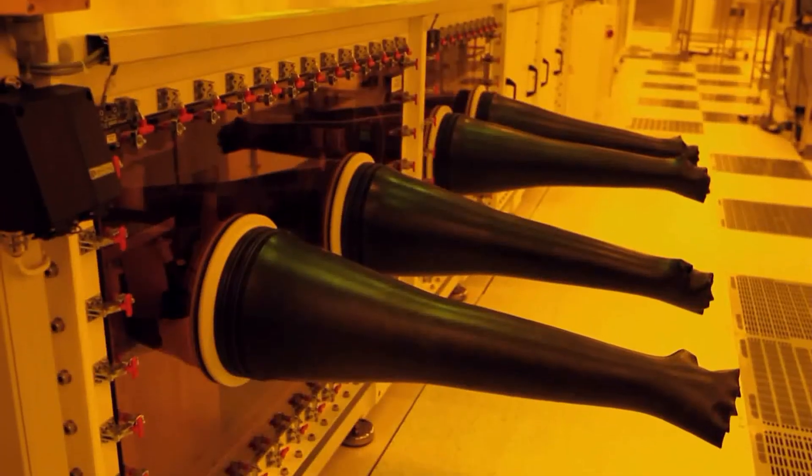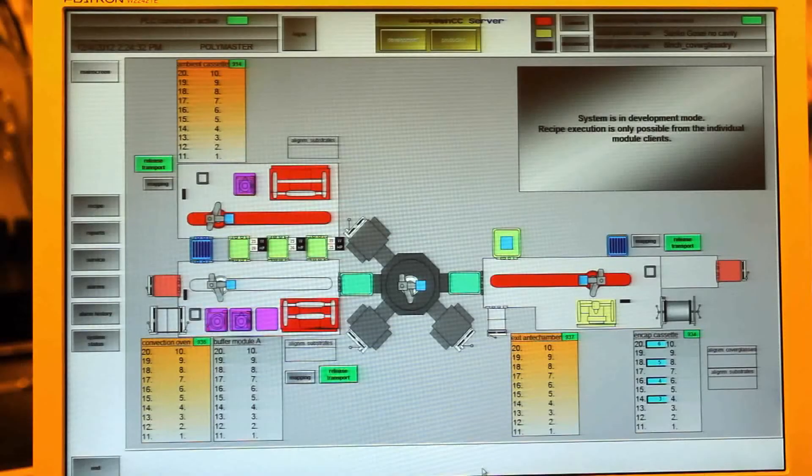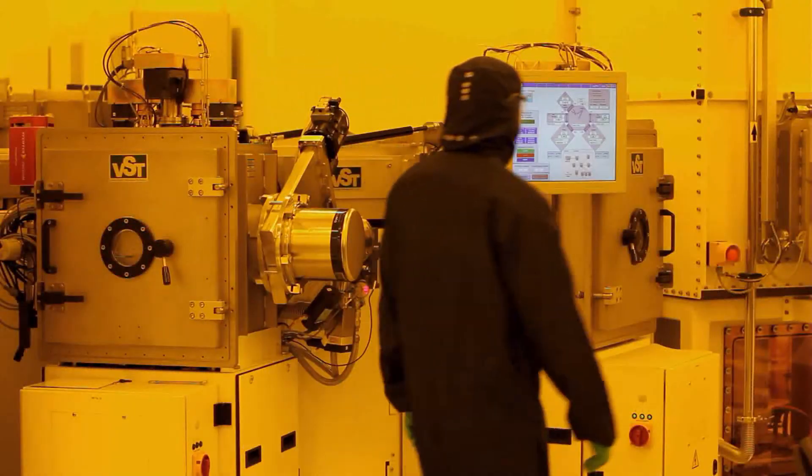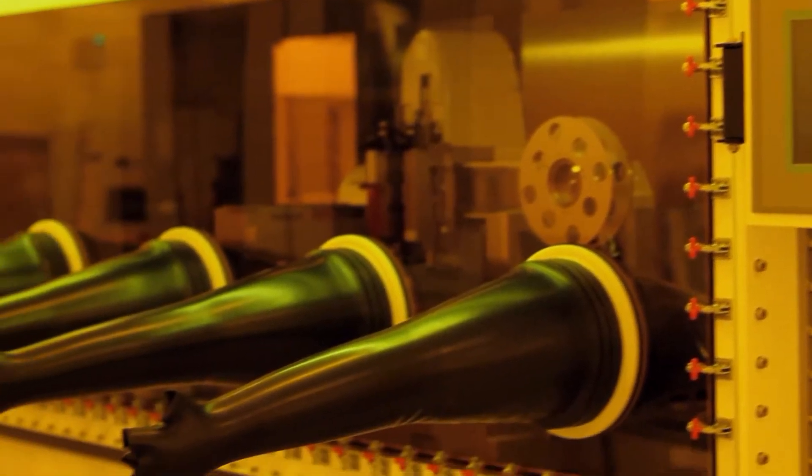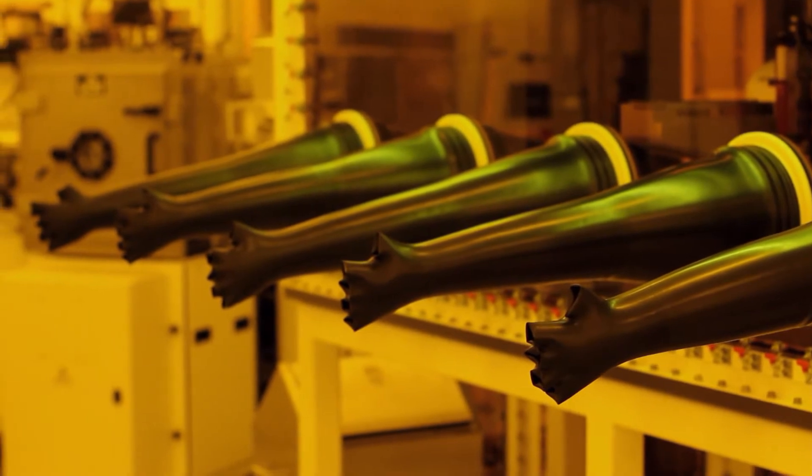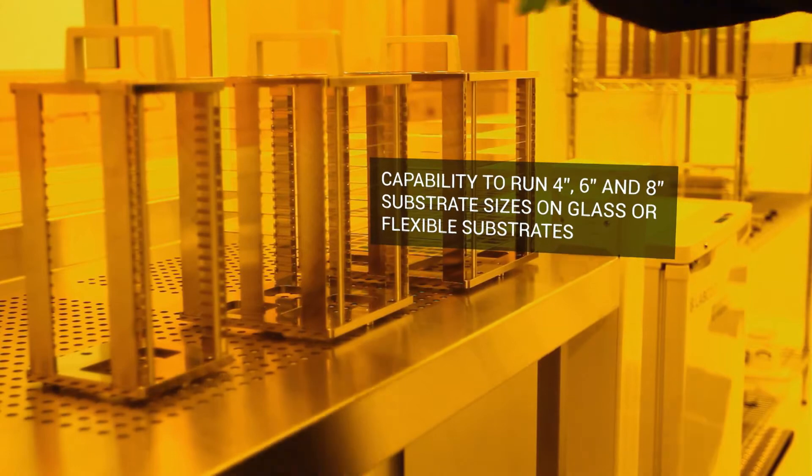It allows the development of high-quality solution processed and evaporated layers in a carefully regulated pilot line. This has been made possible by providing a fully automated, controlled environment to enable the production of defect-free, thin uniform film coatings. The system is located within CPI's new state-of-the-art Class 100 cleanroom facility at the National Printable Electronics Centre.